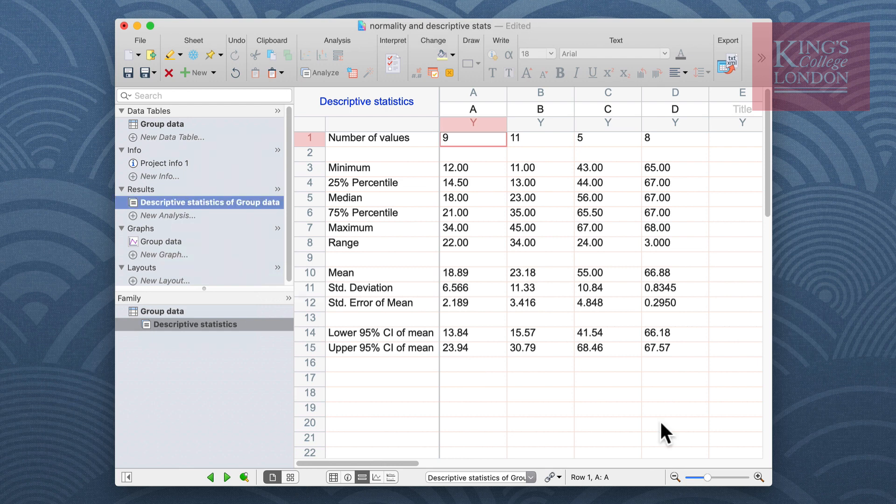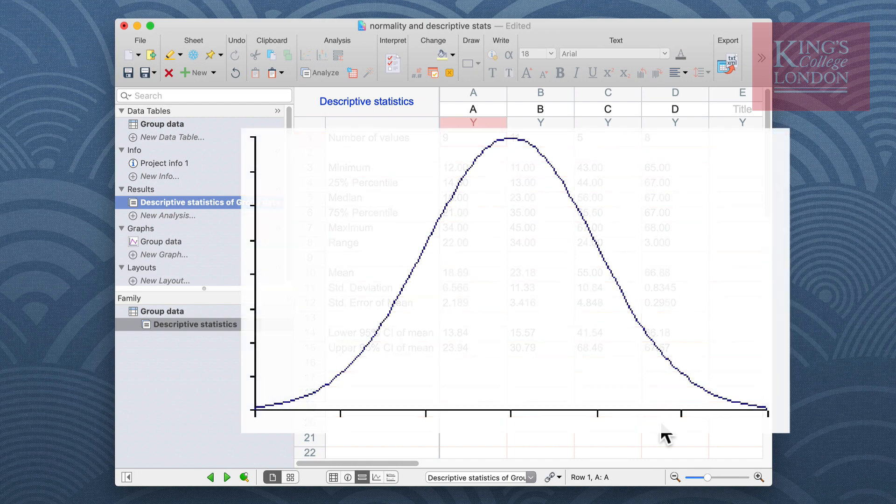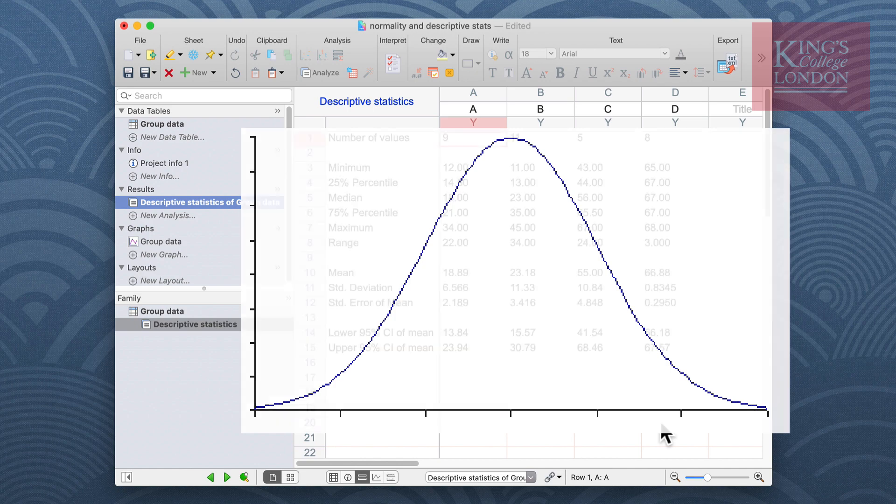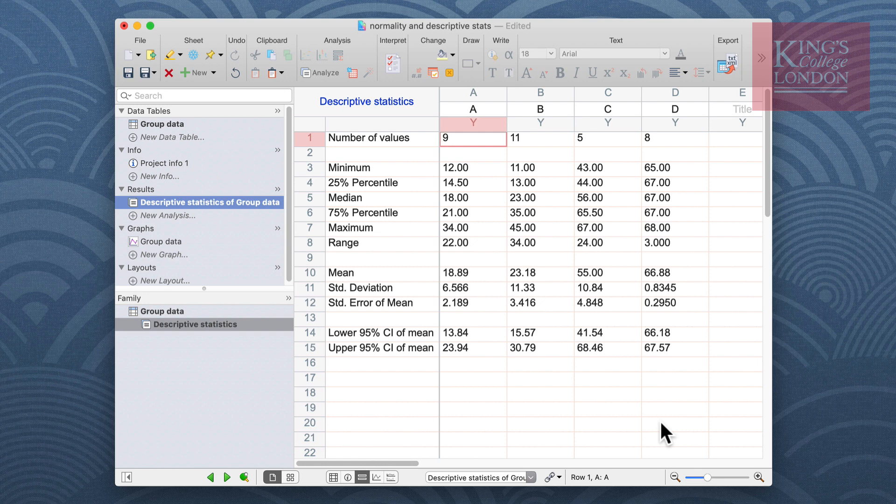Now that we know a little bit about our data in terms of the mean values and distribution around those means, it's good to know whether our data fit to a normal or bell-shaped distribution curve. When carrying out a parametric analysis of your data such as a t-test or an ANOVA, it's important to know whether your data are indeed normally distributed before you do these tests.